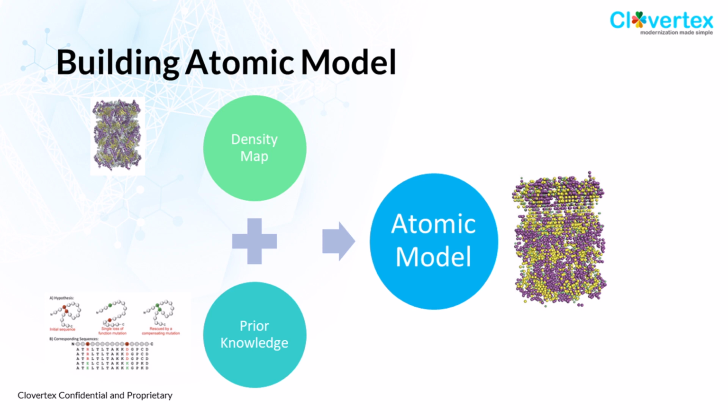What model building needs is the density map, which we receive from the cryo-EM. But you want to be able to bring additional information which you have available for those proteins in question, and bring that knowledge to get an atomic model which is closer to reality.